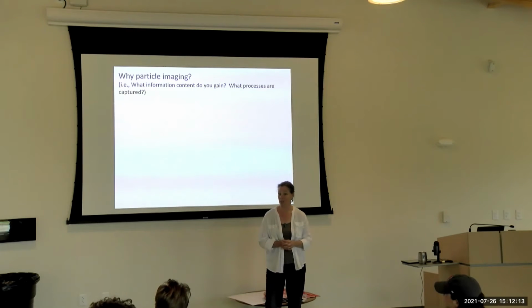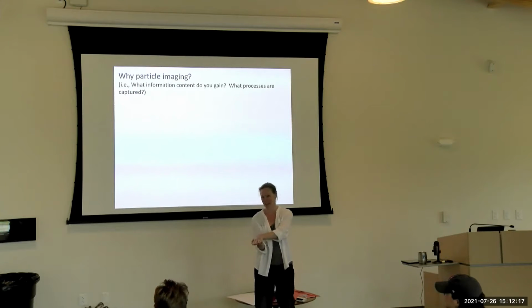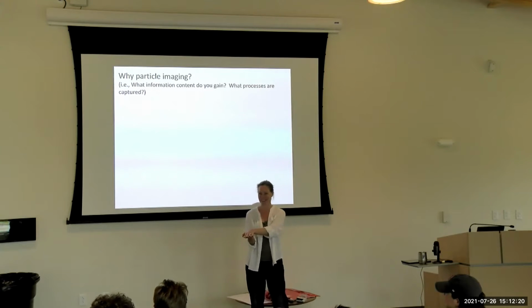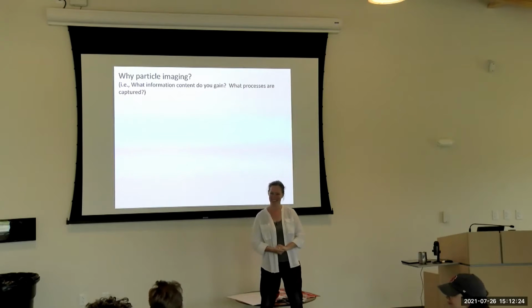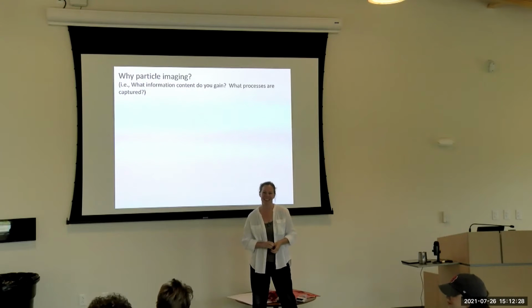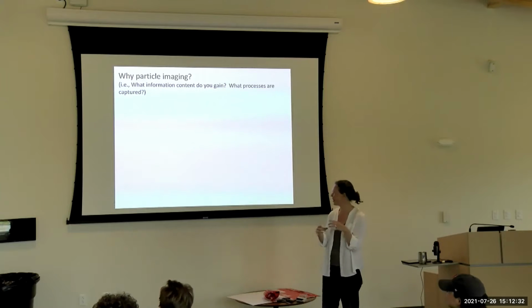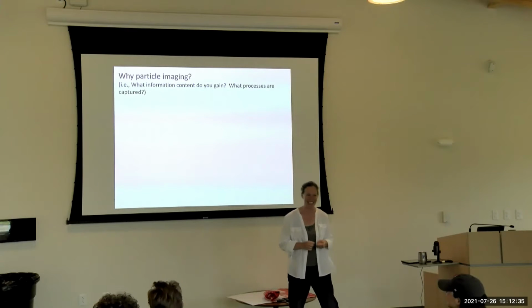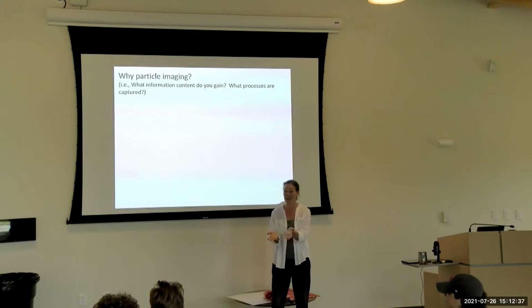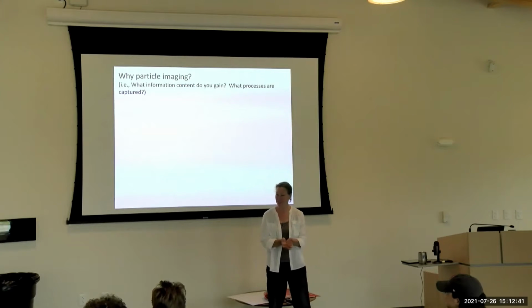Right, so it's not an optical proxy, it's not an inversion of a volume scattering function, but is it direct? Well, we can come back to this, but what do you measure when you take a picture of a particle? You still have to decide what the size is when it looks like the things I was showing you on the last slide. But yes, you're seeing the individual particle, right?